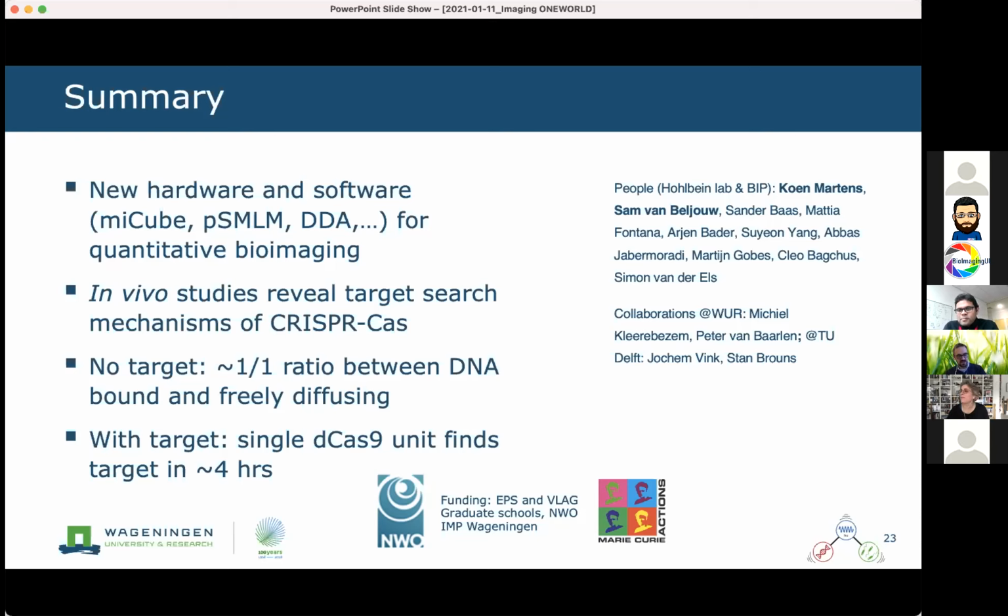For example, in the single molecule FRET field, there was a publication in Nature Methods where people sent out DNA molecules labeled with dyes and asked 20 labs in the world to give their results. In that particular field it was very much on time, and people agreed, for example, on ways to analyze data. So this is now the main go-to reference. For microscopy it's obviously difficult. People like to scan beads in XYZ and look at the resolution. So I think it's not that problematic in a way.